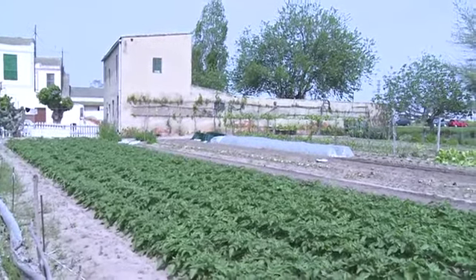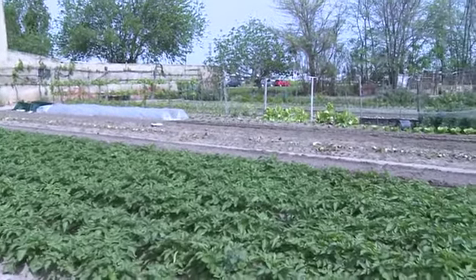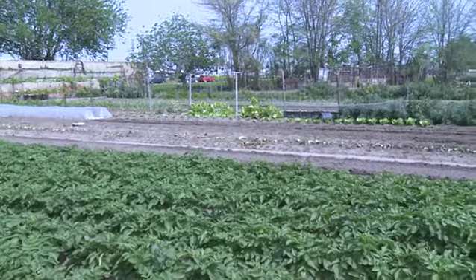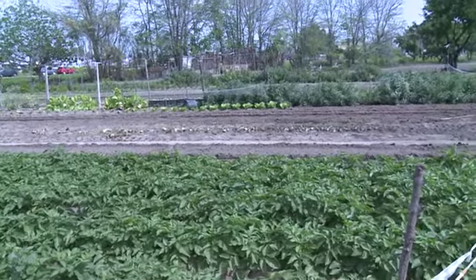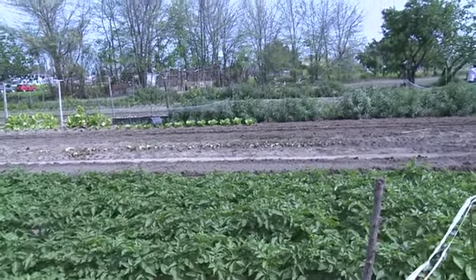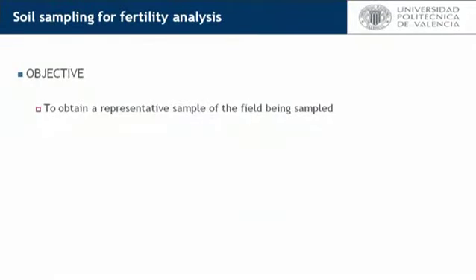In agricultural plots, one of the necessary factors to plan the fertilization is the level of fertility in the topsoil. The surface layer modified by tillage has the most favorable conditions for root development. The purpose of soil sampling is to obtain information about the soil. The objective of the sampling design is to evaluate soil properties at the lowest possible cost by obtaining a sample that is representative of the entire plot.